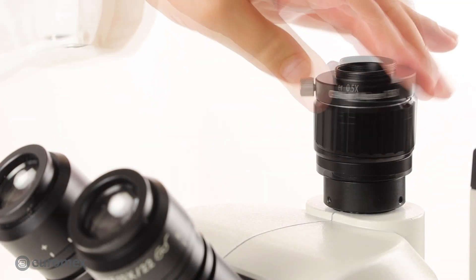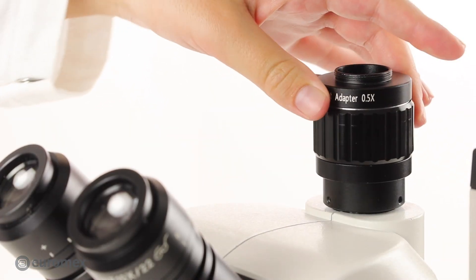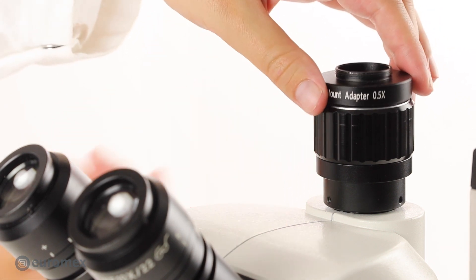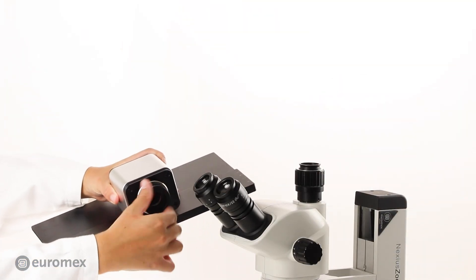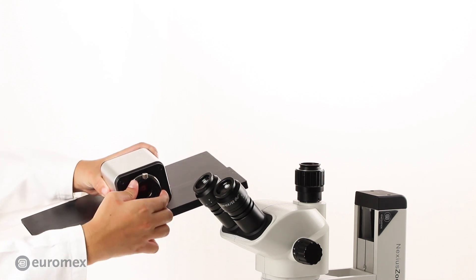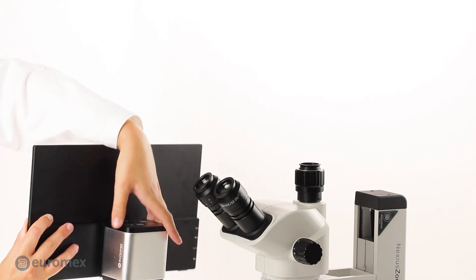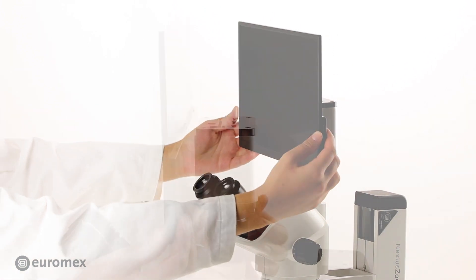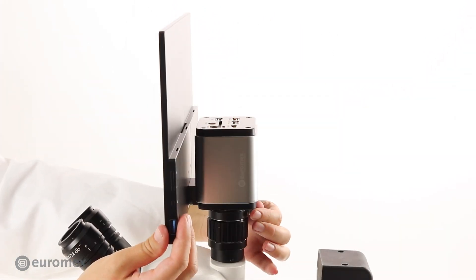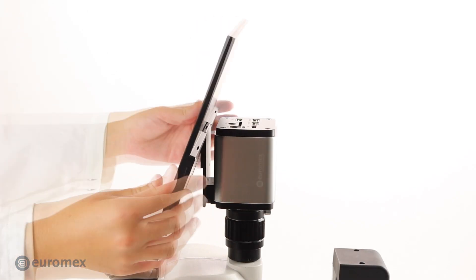If you would like to use another C-mount adapter from our product range, unscrew the top ring and attach it to the camera. Fixate the camera. You can easily change the angle.